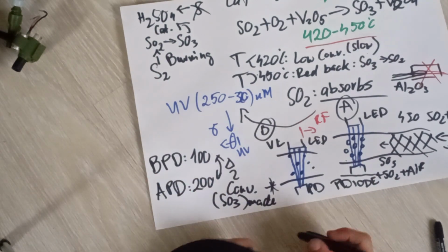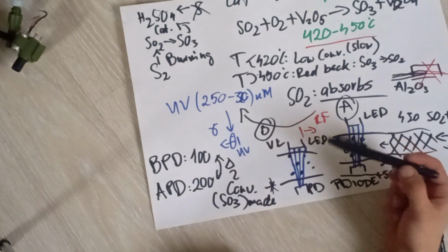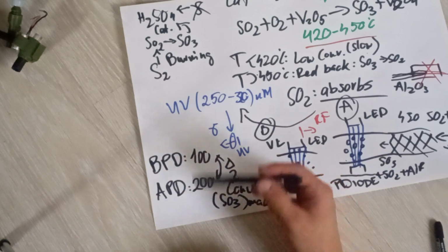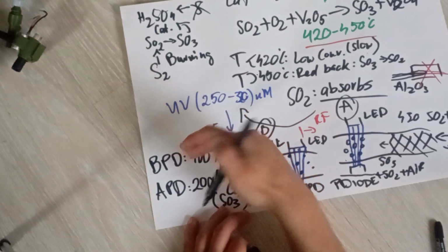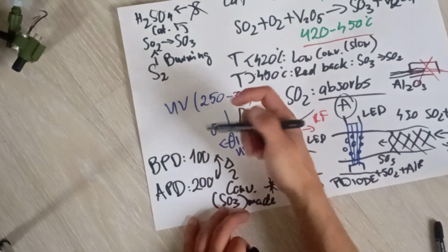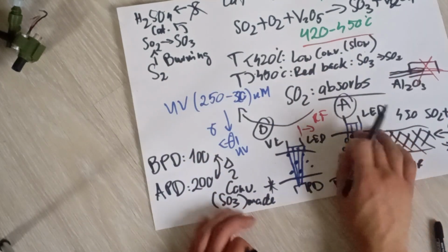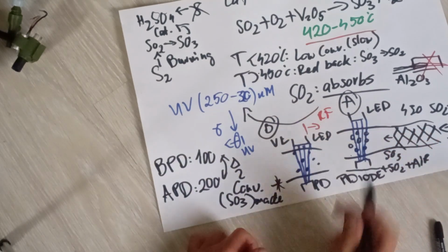It is this simple. Of course, there is some nuance: you want to set initial data, because let's say your photodiode is sensing 300, and they have different numbers when they run dry, basically when nothing is coming in and there is no concentration.